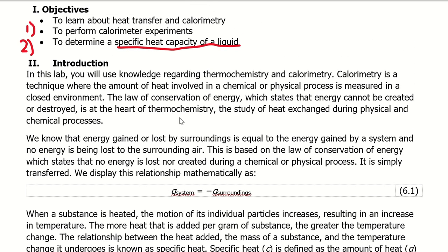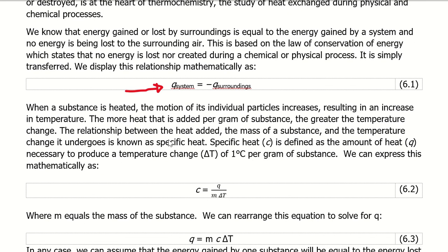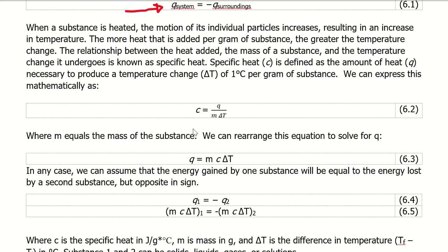As always, the intro has really useful information about thermochemistry, about the relationship of energy between system versus surroundings. Energy is neither created nor destroyed. It's simply transferred from one thing to another, so from the system to the surroundings, or the other way around. And then we go a little bit into what specific heat is.